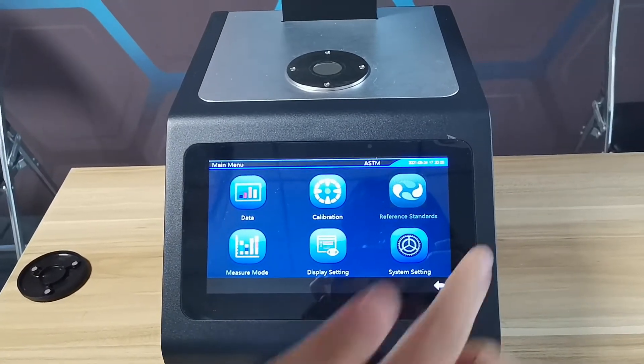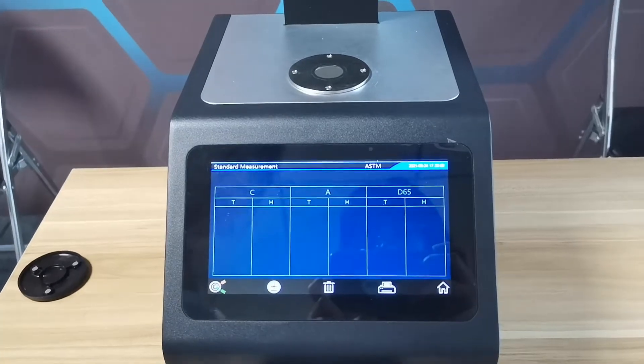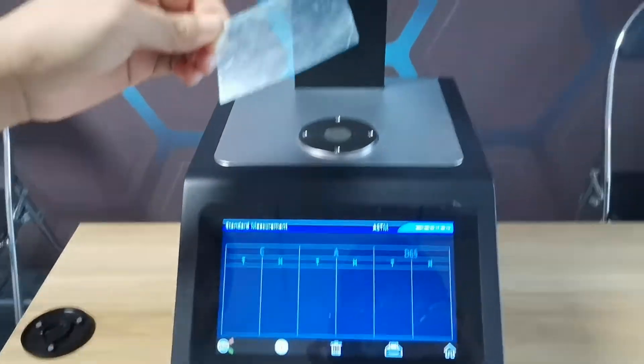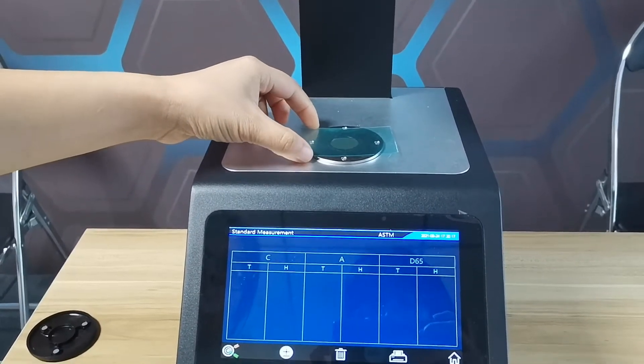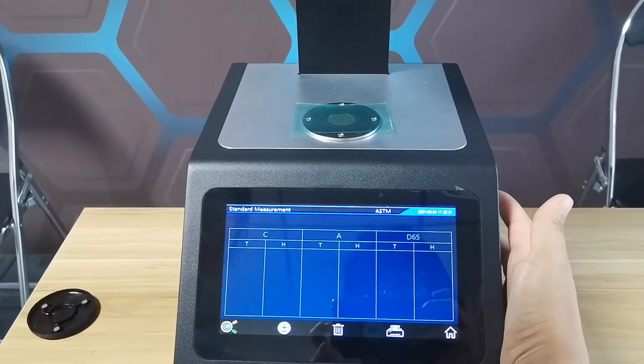Then, measurement. This is the transparent film. Put it on the aperture. Press the measurement button.